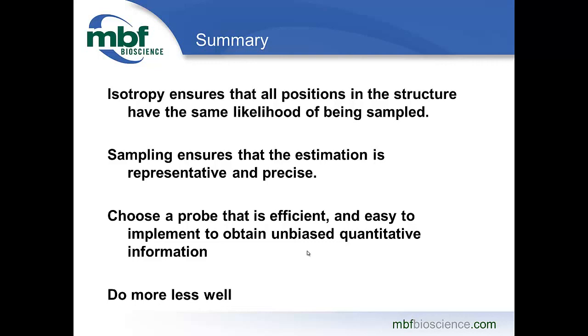And as we went through this talk, I hope that this idea behind stereology to do more less well also came out. Right, but do more less well does not mean an incorrect answer. So let's just hark back to what you gain by thinking about the answer you want during your experimental design phase and choosing stereology over a method like ImageJ or something like that, where you're going to use an image analysis program to count cell profiles.